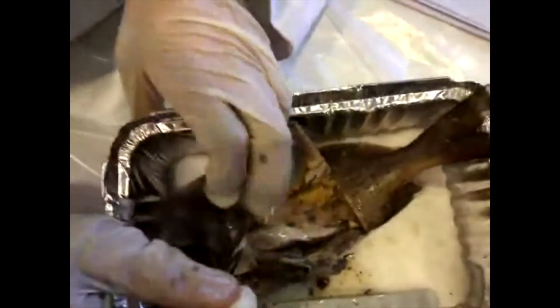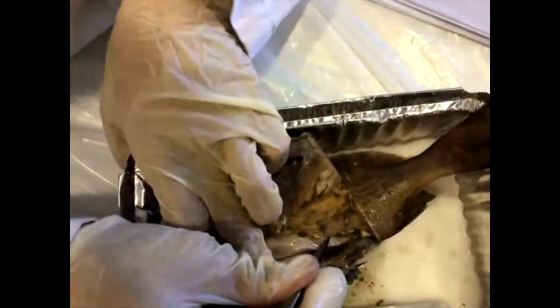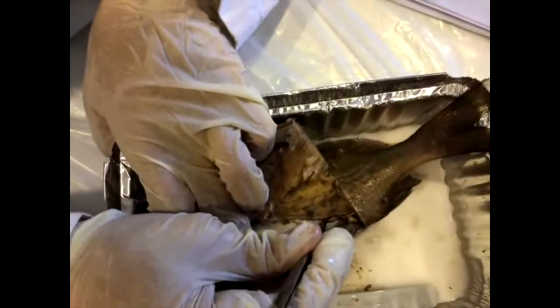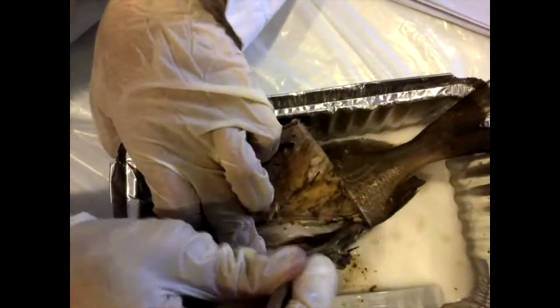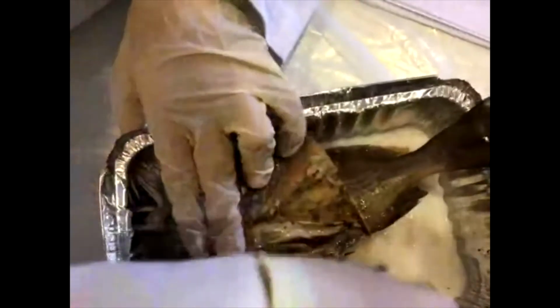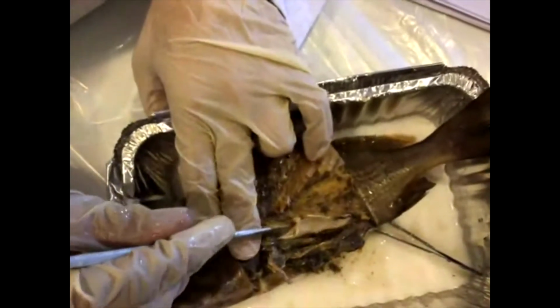Now, I'm just going to lift up these other body parts for a moment, because I want to talk about this big white organ here. Does anyone have any guesses on what this could be? And I'll give you a big hint. Humans do not have one. I'm also going to, while you're thinking about what it might be, make a little tiny incision so we can see what's inside.